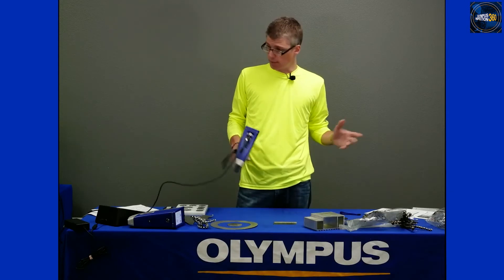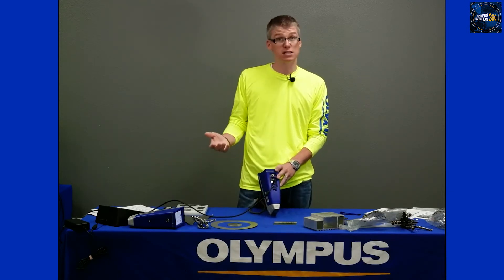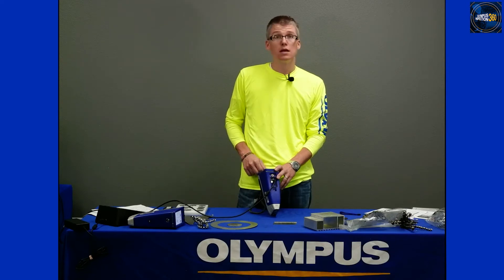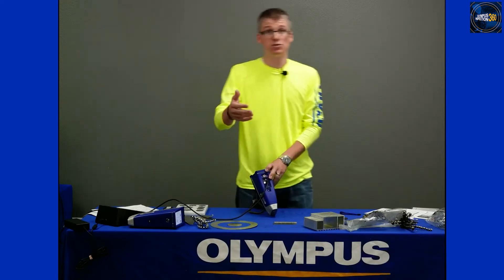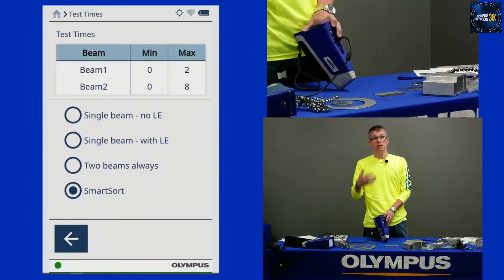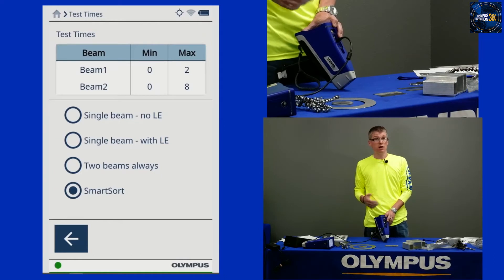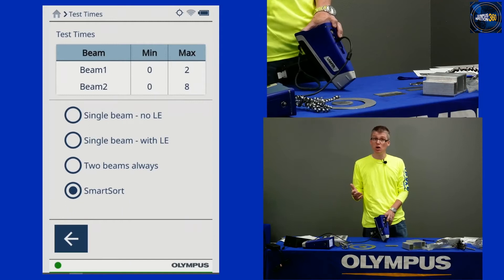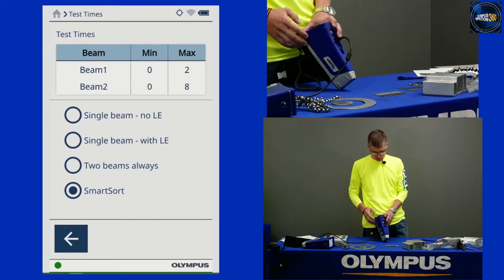Looking at the instrument screen, let me draw your attention to a couple of things. First, let's think about test times. I've got a stopwatch icon at the bottom, or I can pull it up in the menu tray to get to test times in my beam settings. You can see options here for single beam, two beam, and smart sort. If I'm going to be working mostly with stainless steels, high temps, and super alloys — all single beam alloys — I can put this in single beam mode, specifically single beam no LE. This helps minimize the impact of dirt. Out in the scrap yard there's lots of dirt, and you want to minimize that impact. With single beam no LE I can sort most of my stainless.